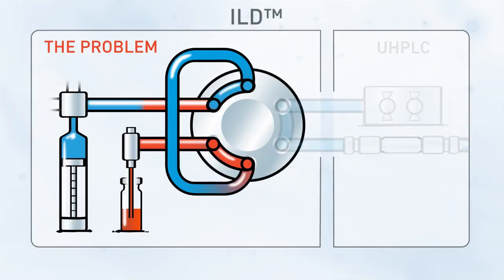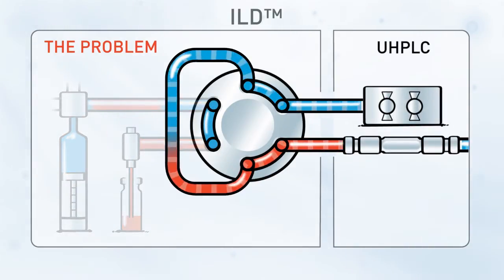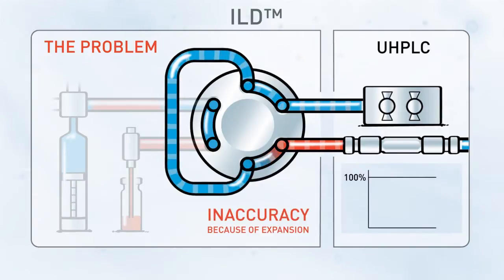The syringe draws an accurate volume of sample into the loop, but part of that volume is diluted sample. Switching the injection valve introduces the partly diluted sample into the UHPLC system, resulting in peaks that represent analyte concentration with a negative deviation in accuracy.